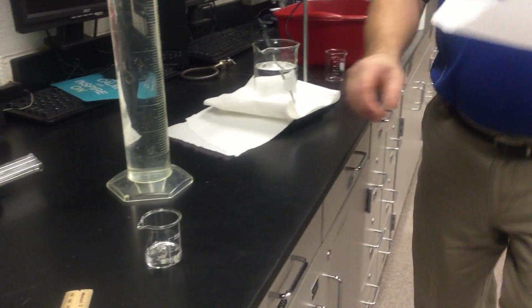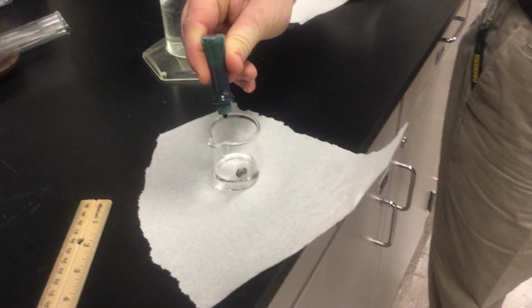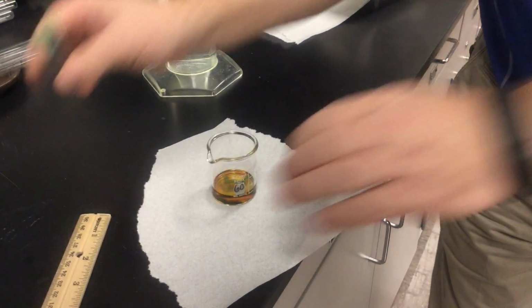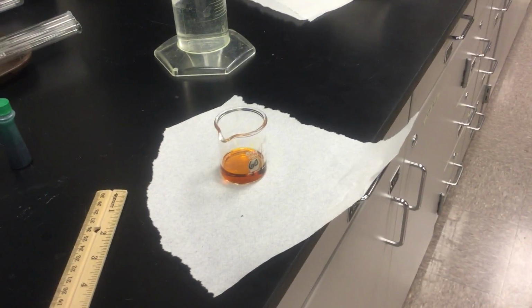So let me tear off a little piece of white paper. I think you're going to be able to see it better on a white background. But here's my green food coloring, 3 drops. And when I stir it up slightly, what's your observation of my green food coloring?